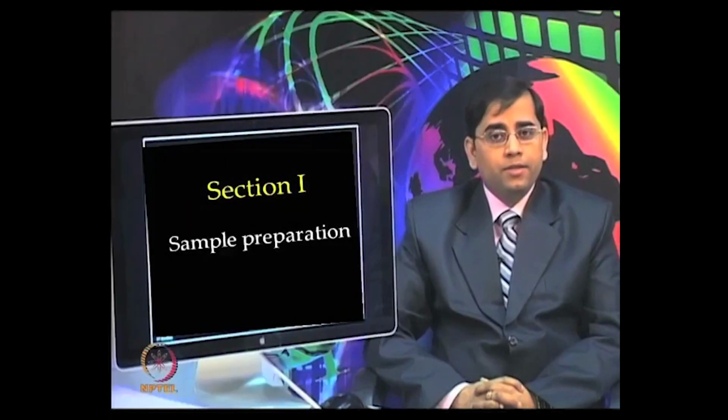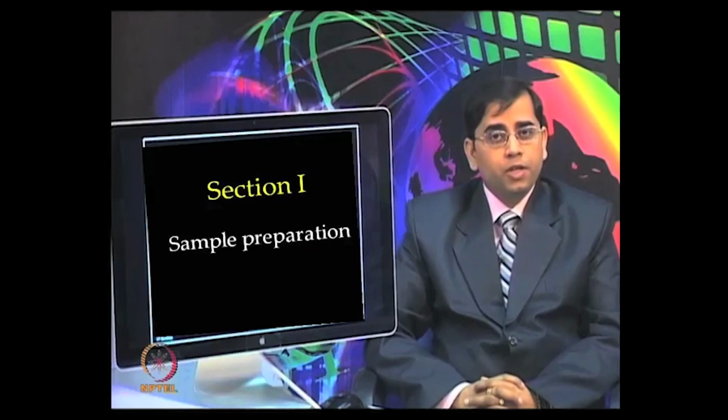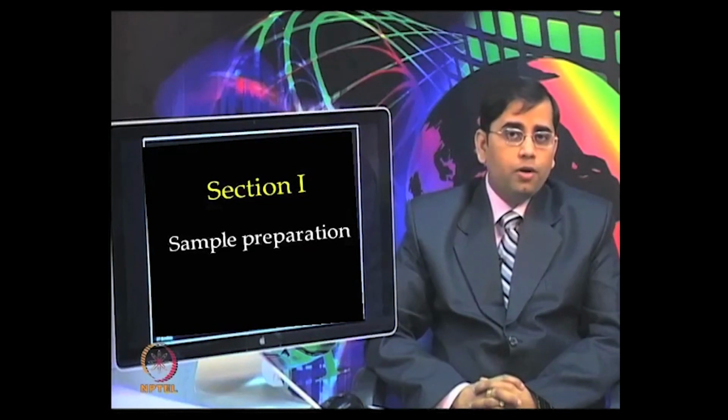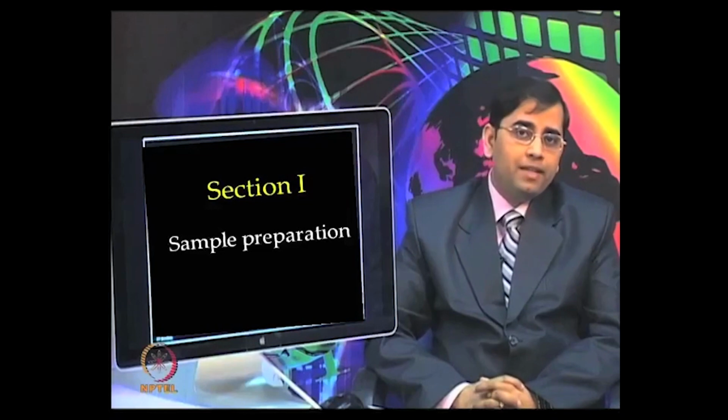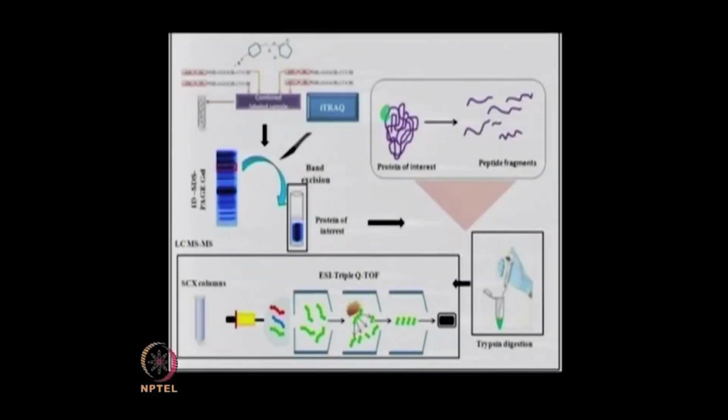The in-gel digestion procedure is compatible with the downstream mass spectrometry analysis, whether you want to continue with the MALDI-TOF or you want to do the LC-MS based mass spectrometry analysis. In-gel digestion of proteins for MS analysis video.